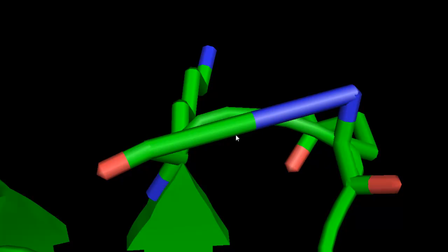What I mean by that is that for this bond to be shorter, these residues forming this bond might have to change in its rotomeric conformation or even other residues around this deletion in the structure itself. Honestly, PyMOL is not very user-friendly when it comes to this, and after extensive research, I'm not even sure PyMOL can handle something like this reliably.